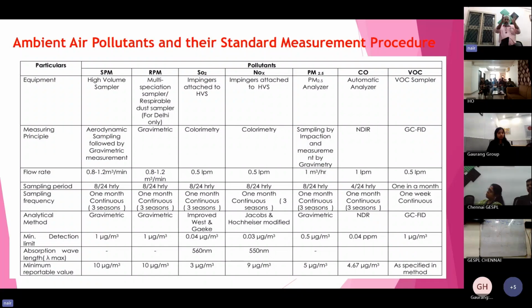So the laboratory reports this many micrograms of SO2 inside the impinger, and that is for the 480 liters of air.